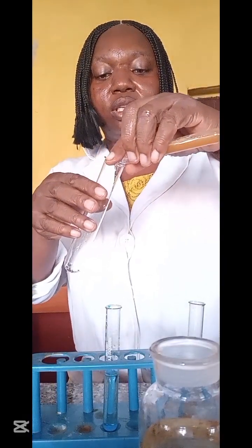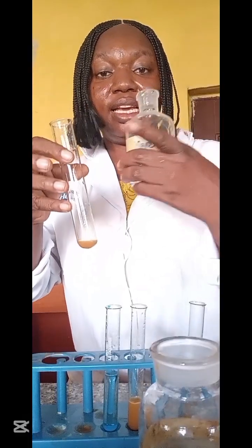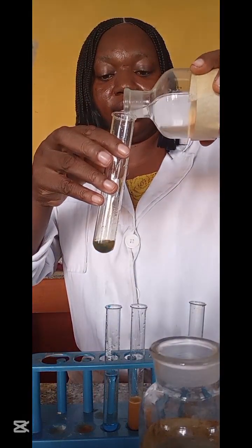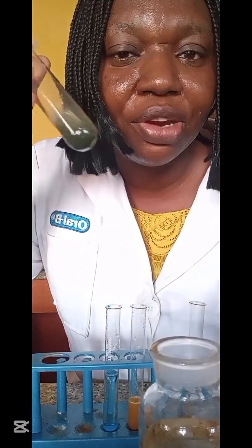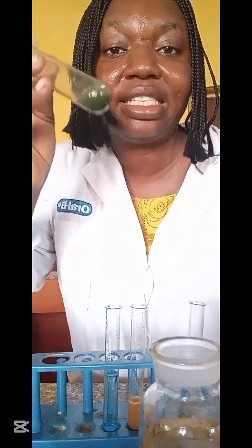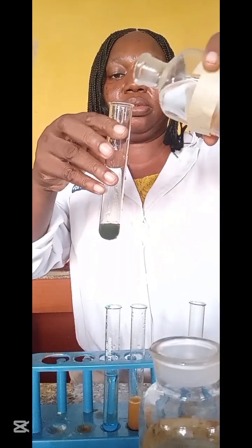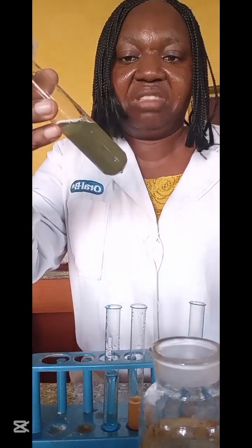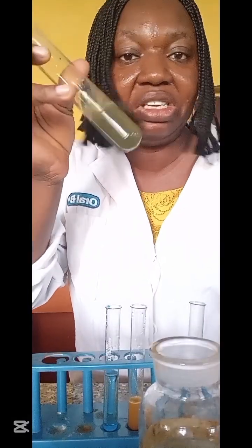So this solution is supposed to be iron 2, and if it's iron 2, it's supposed to give us in sodium hydroxide, you see, a dirty green. This is like army green. They call it dirty green gelatinous precipitate. In excess sodium hydroxide, it does not dissolve.